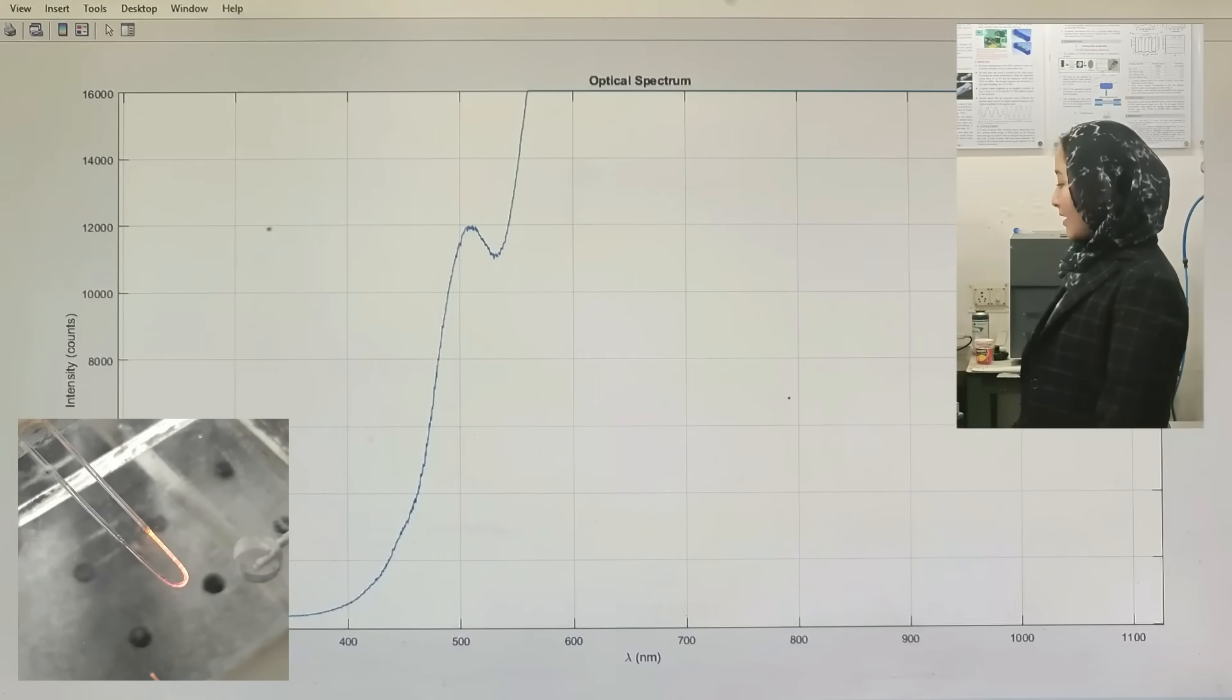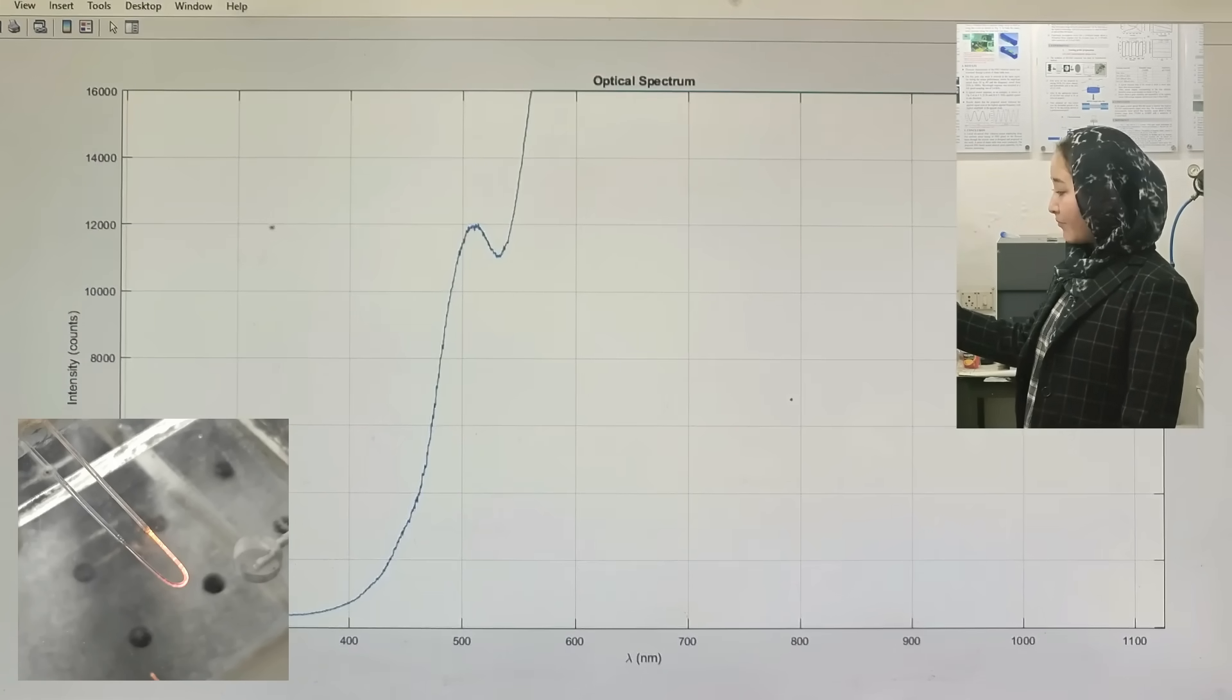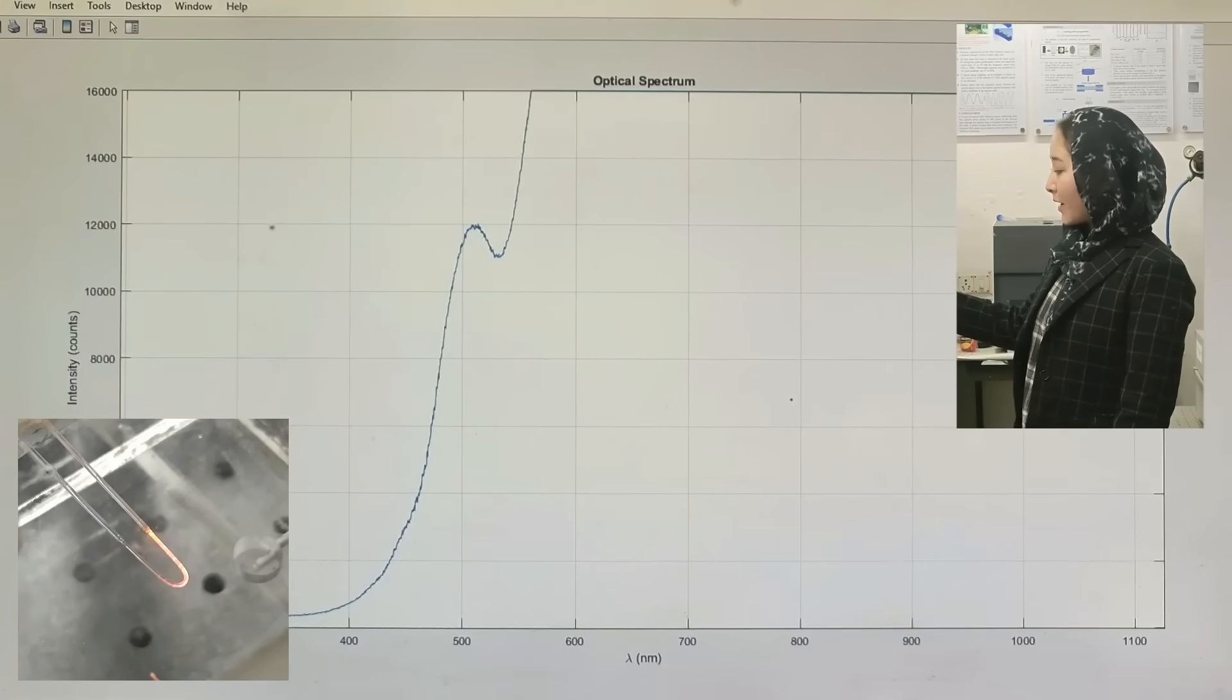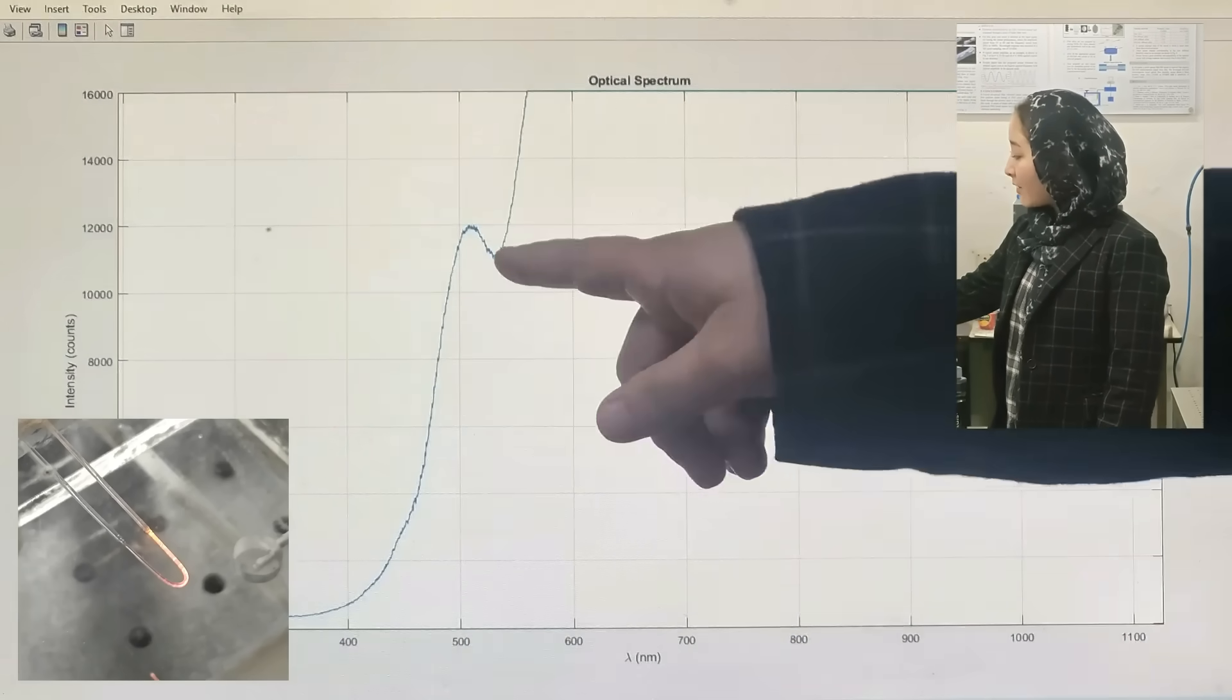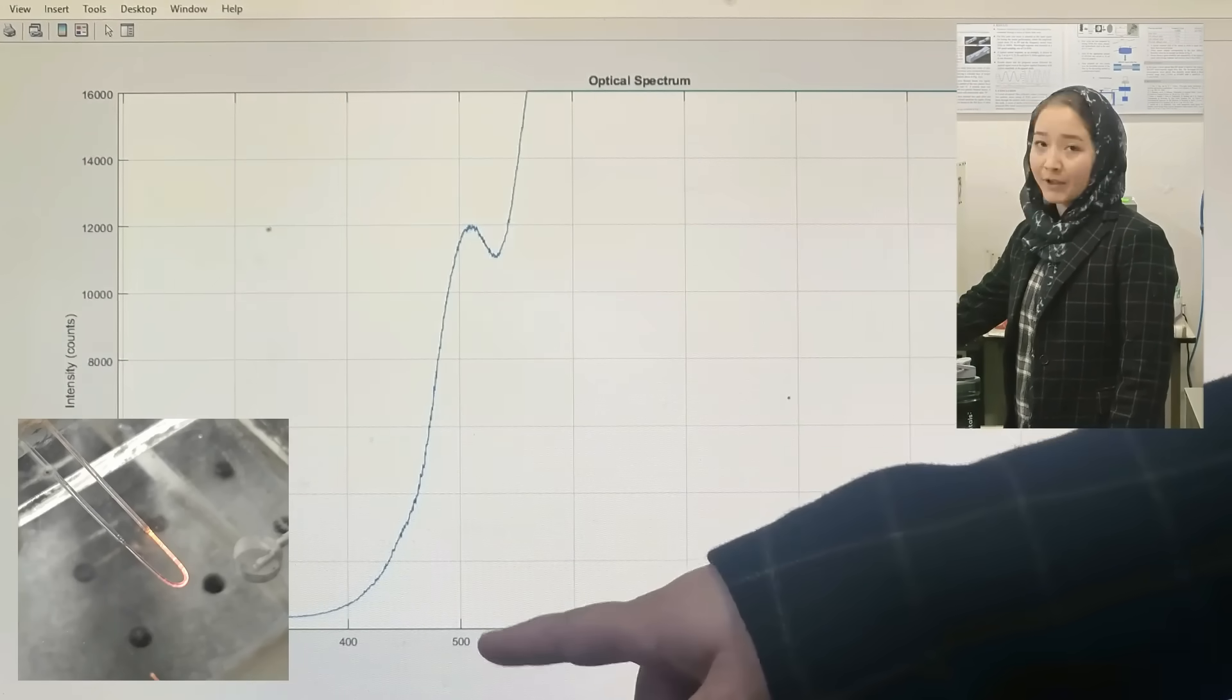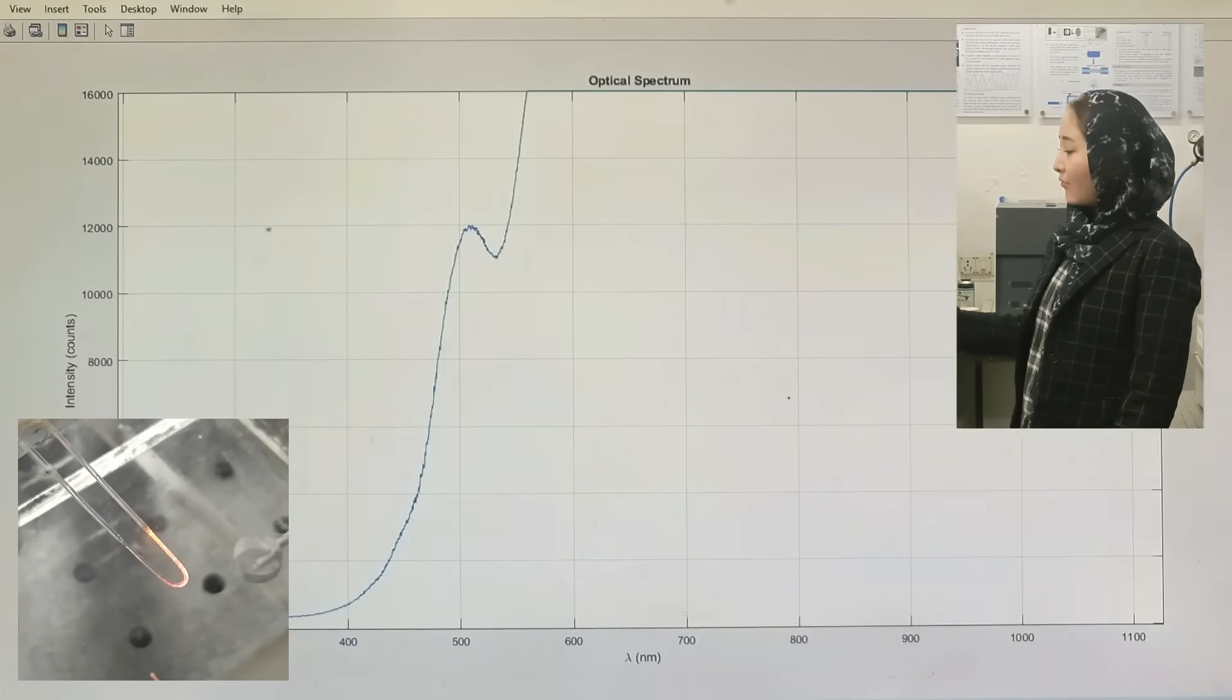As you can see, this is the transmitted spectrum being captured from the optical fiber sensor when the sensor is exposed to air. In the spectrum, you can see a dip. This is the resonance dip that occurs at a particular wavelength and this resonance dip is the characteristic feature of LSPR.